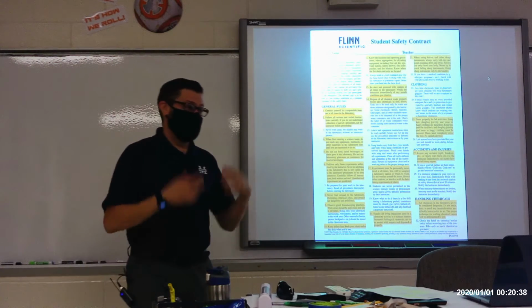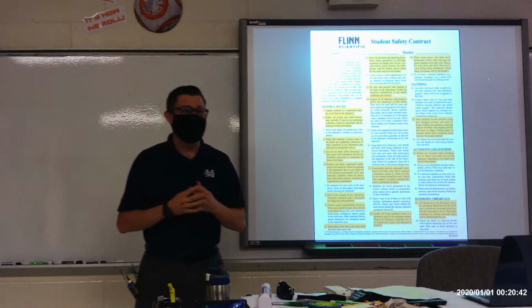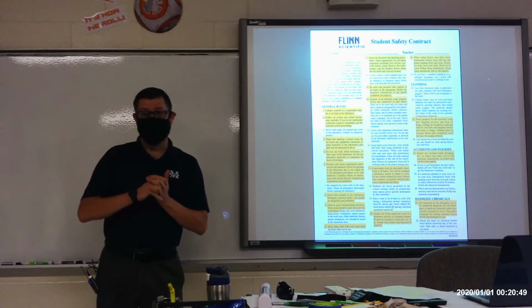Okay. So if you really have something in your eyes and you need to use the eye wash station, you're probably not going to be too worried about splashing a little bit of water and how long you have to rinse out your eyes, because you're more concerned with how much it hurts.